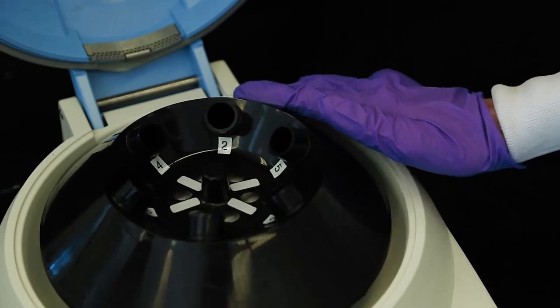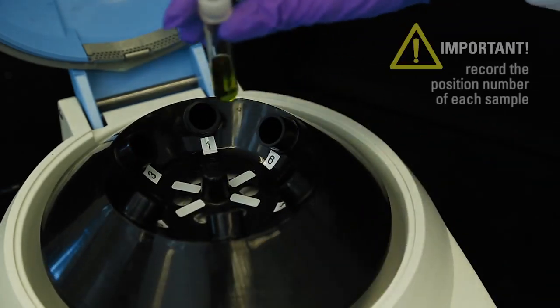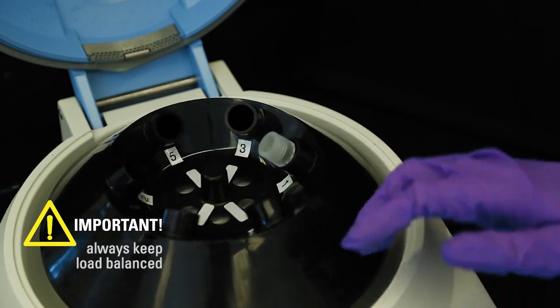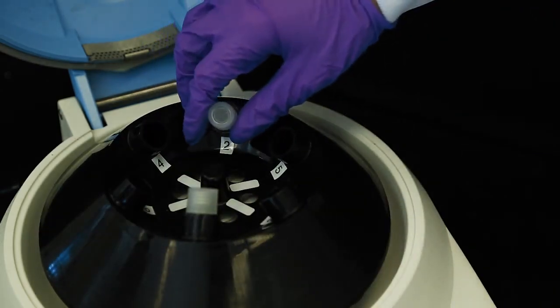Our centrifuge has 6 positions. All positions are numbered. When placing a test tube into the centrifuge, make note of the position number. Make sure every tube in the machine has a corresponding tube directly opposite to it for balance.